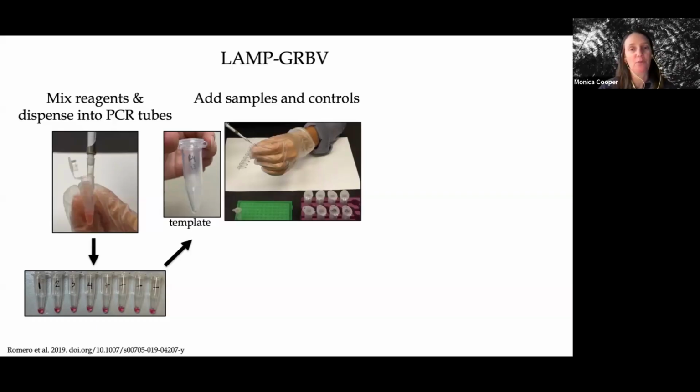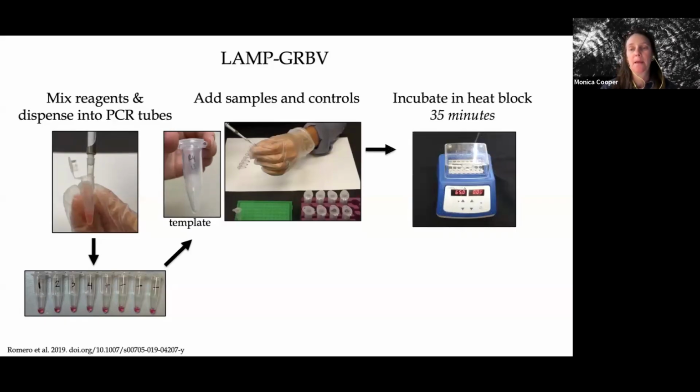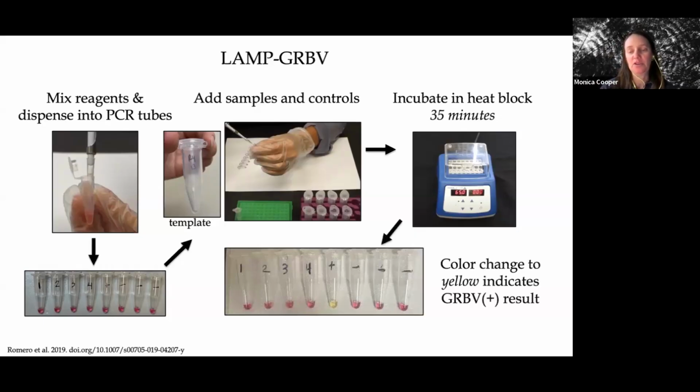You'll also add your controls at that point. After that, you will close all those tubes very tightly and incubate them in a heat block for 35 minutes.